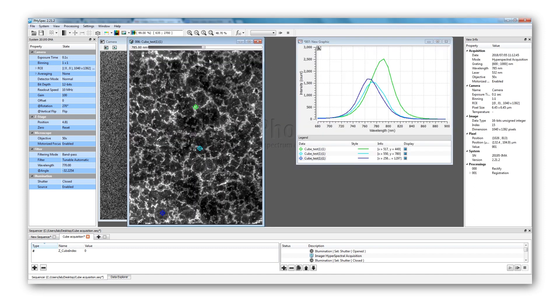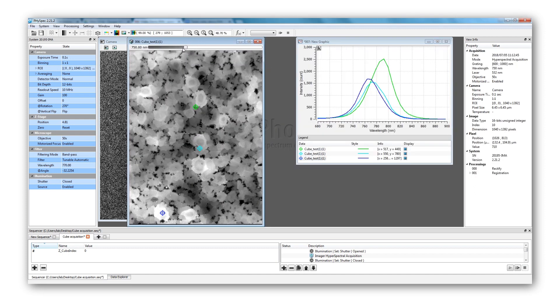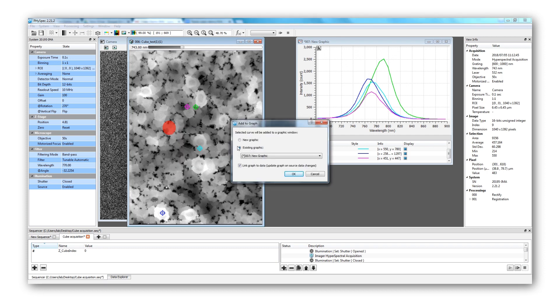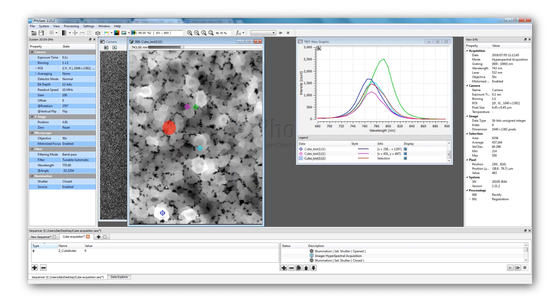Each target, once drag-and-dropped into the graph, will draw the photoluminescence spectrum of the pixel. Instead of individual points, we can also average a region of interest — a rectangle or an ellipse — giving an average spectrum of all the pixels included within the area. Note that even in the darker regions, there is still some signal coming from the sample.